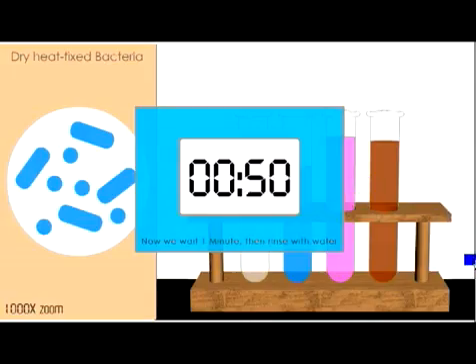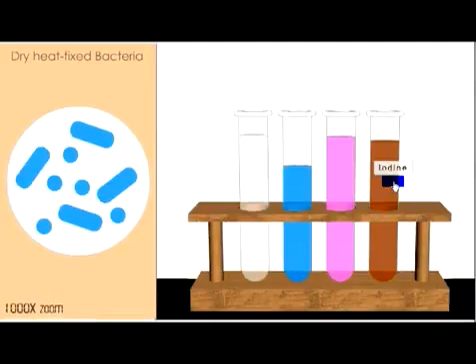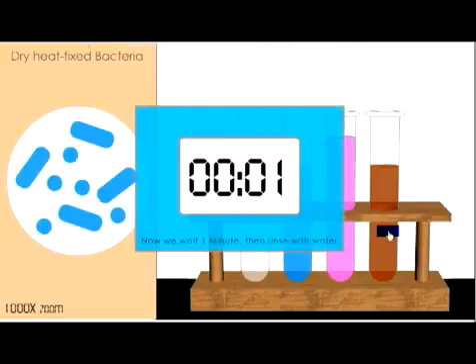Okay, our minute is almost up. You can see that our cells are staying this bluish or purple color. And after the minute's over, we will give a quick rinse of water, and then we're ready for the next step. Okay, the next step is to add iodine. You can see iodine is a brownish yellowish liquid, which is going to form a complex with crystal violet. We'll add that to the slide, and again we have to let that sit for about a minute.